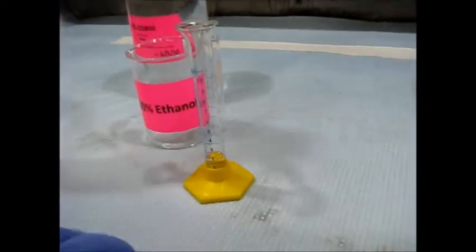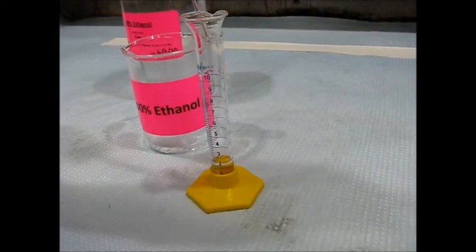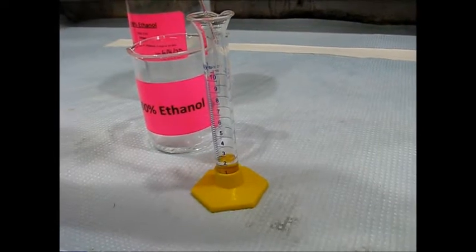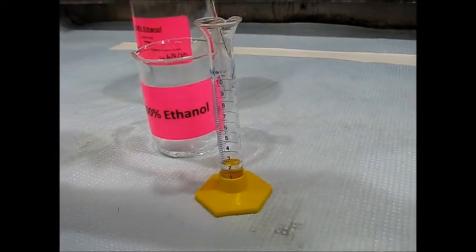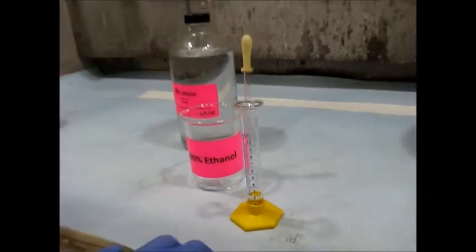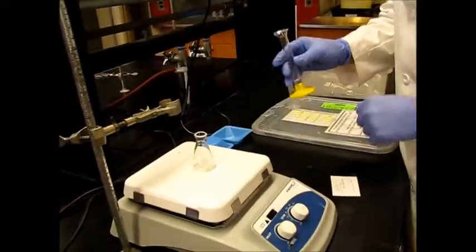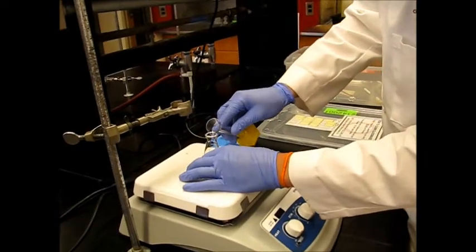Now we're going to add half a mil. And that's good right there. We're going to use this as our solvent for our reaction. We'll be running the reaction in this 25 milliliter Erlenmeyer flask. Go ahead and pour this in here.